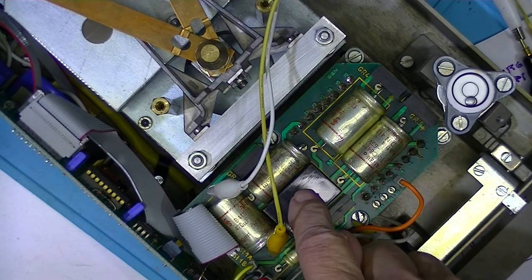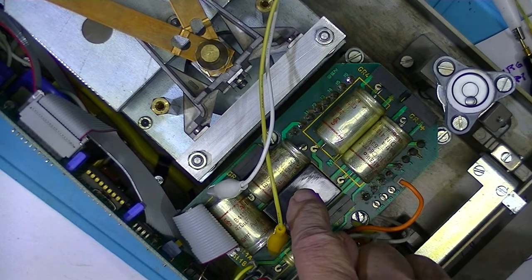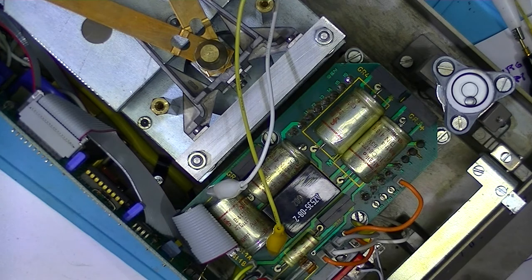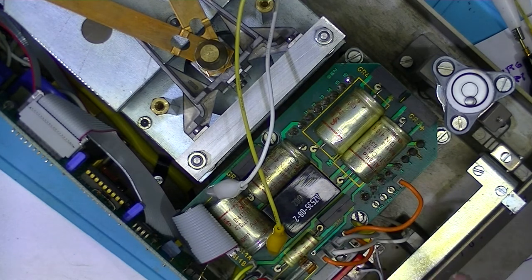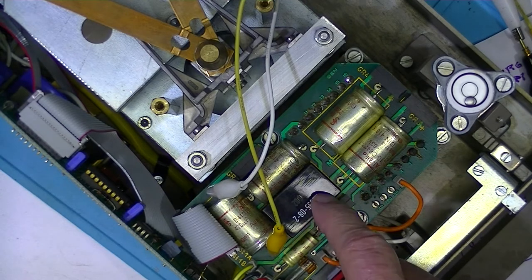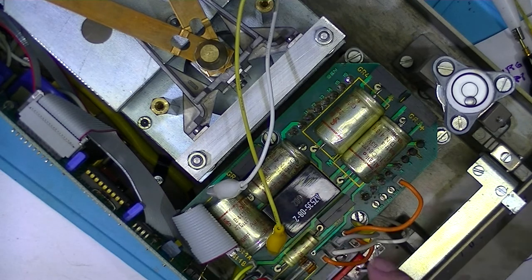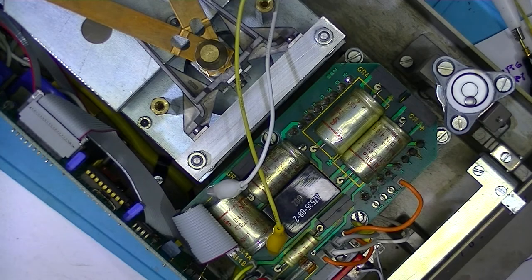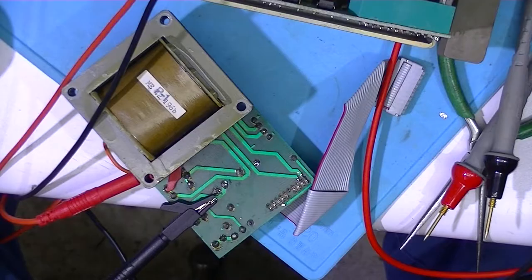This right here is a 24 volt relay, so I guess I'll take this power supply board back out. I've already had it out once and apply 24 volts to the relay terminals and see if anything happens.